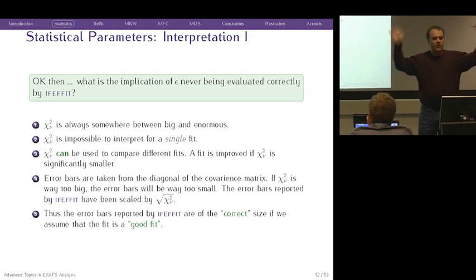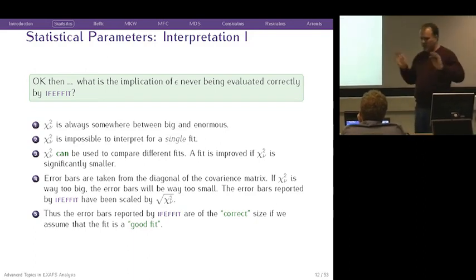This is a good fit. This is statistically good. I'm done. I'm going to go publish now and then go home. You can't do that with a single fit. You can't press the fit button once.